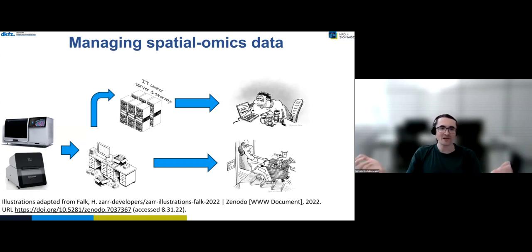And this is already a lot if one is analyzing their own data, but if one wants a more cooperative approach with multiple bioinformaticians, or to share the visualization with a histologist or a pathologist to get feedback on their annotations.